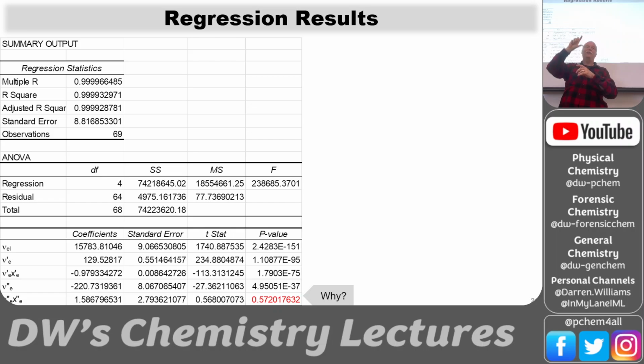And we can tell, oh yeah, this one's a little smaller, this one's a little smaller, a little smaller, a little smaller. Down here we have 0 to 1. And then we have 1 to 2. And 1 to 2 is maybe a little smaller than 0 to 1, maybe not. And that's it. That's all we've got for the ground state. We've got 2 differences, and we're trying to determine if the second one is statistically different than the first. And we're just not sure. Does that make sense? We only have two difference measurements in the ground electronic state, which is the double primes. And so for the anharmonicity constant, we can't really say that the second difference is substantially different than the first difference.